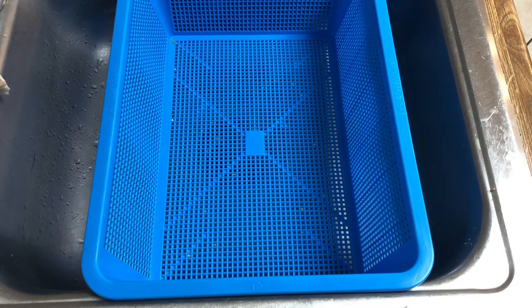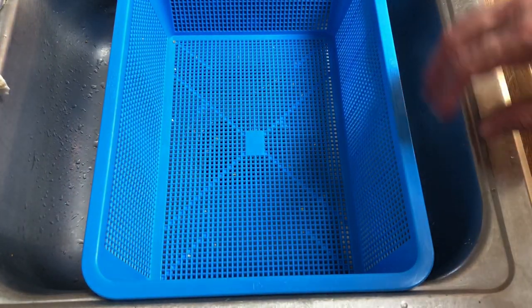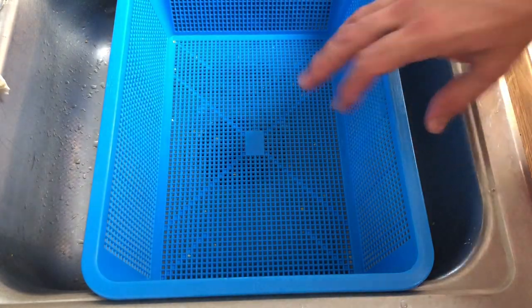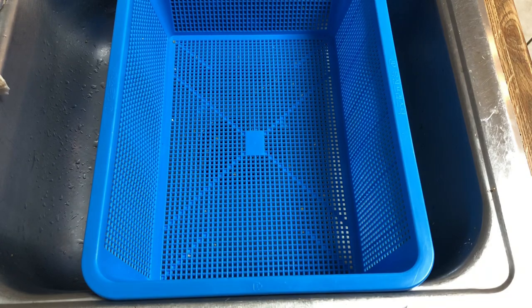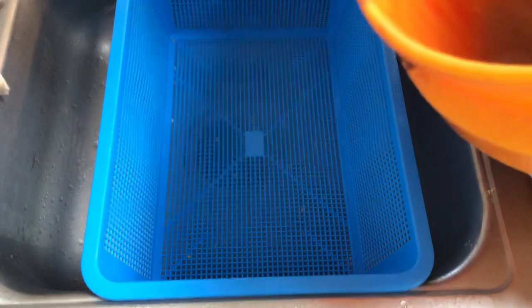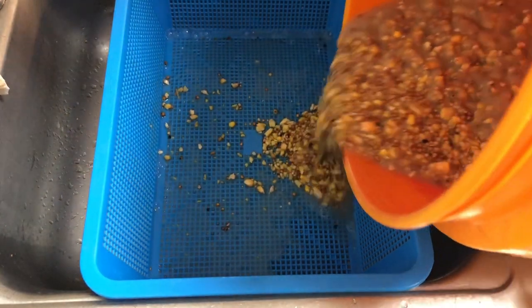We're gonna take it and run it through a strainer. So if you need a big strainer, you can buy them from pretty much any Asian market. This is the smallest size they have, but you could fit a pretty good amount of grains in here, probably 9 or 10 quart jars. They have ones that could fit literally like 4 entire 5 gallon buckets full if you needed that much. Dump it in here.